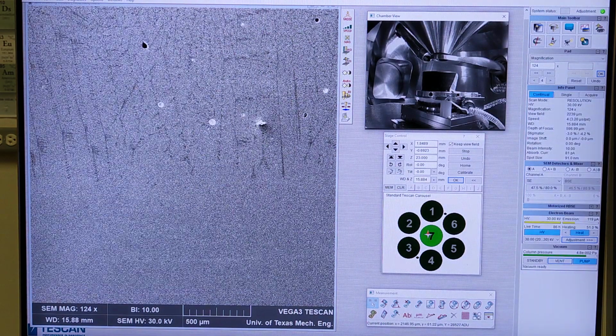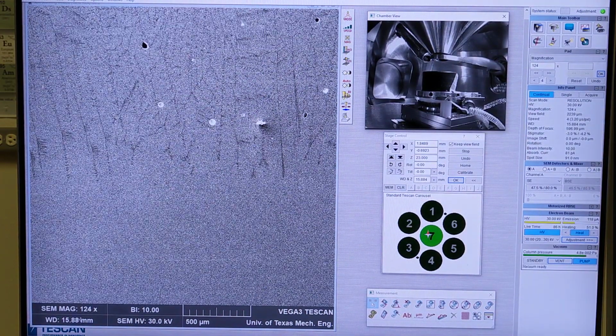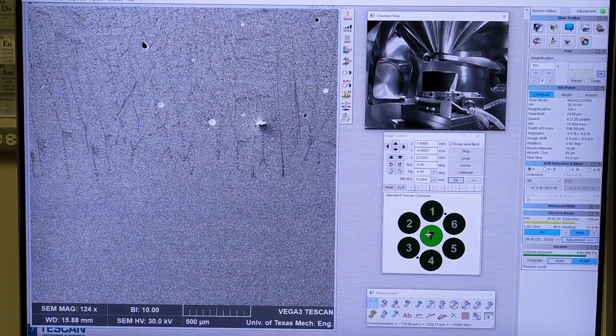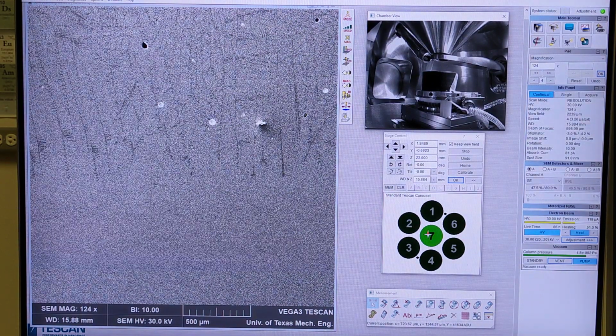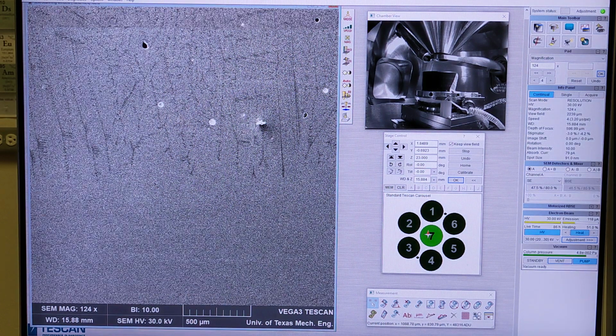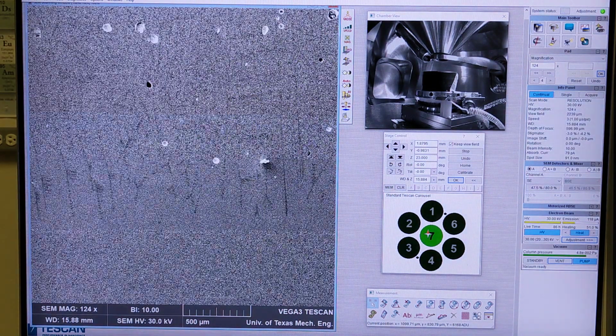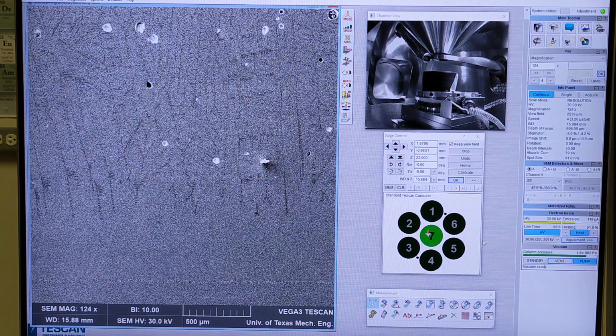So when you're focusing your image, you want to raise your sample and you want it to be in focus at a WD of 15. Now this works well anywhere from a working distance of 10 to 20. So it doesn't have to be specific, but the closer you are to that 15, the more efficient your data collection is going to be, okay? So I'm at about 15.8.